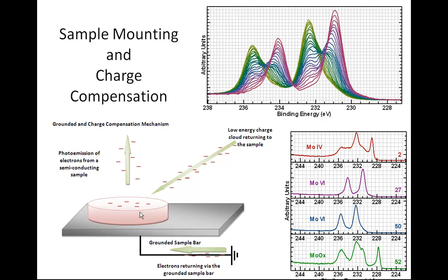And so we ought to be able to measure a metallic sample and potentially an insulating sample with similar ease. But if we have a material that for some reason changes during the course of a measurement, then this relationship may cause problems. In what follows, I'm going to work through this VAMAS file and organize the data in such a way that I can understand and give an explanation of what I think is happening to cause the movement of these peaks in binding energy.